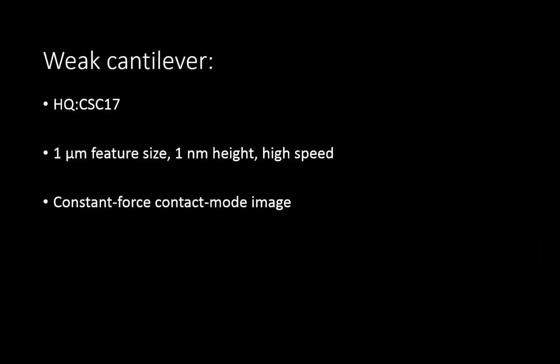Start with the weak cantilever. For this purpose, use the HQCSC17. In the imaging wizard, set the feature size and feature height to 1 micrometer and 1 nanometer respectively. Set the scan speed to high and obtain a constant force contact mode image.